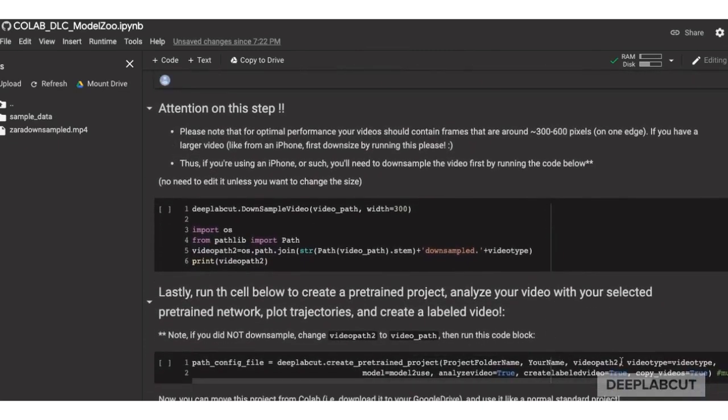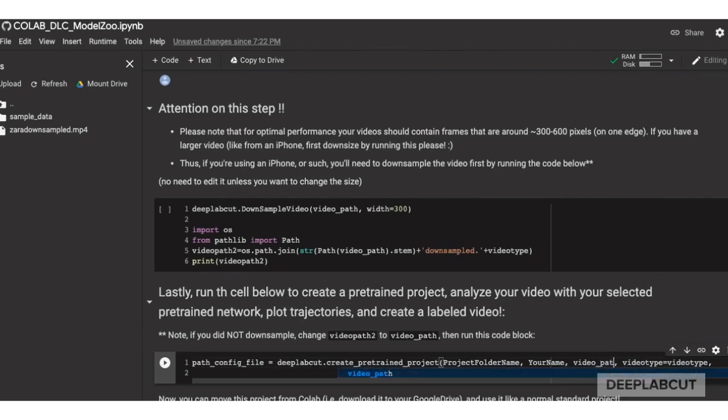You optionally can downsample a video, which is a good idea if you have a very large video, like something from an iPhone.